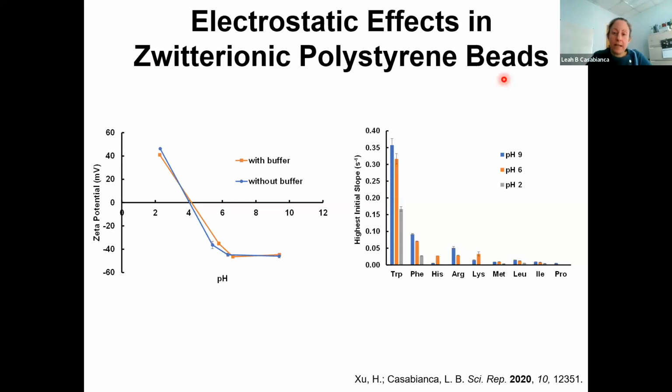Aside from aromatic interactions, we also saw that electrostatic effects were important in this binding. So to explore this in more detail, we looked at zwitterionic polystyrene beads that, again, we could purchase commercially. These have a mixture of carboxylate and amine groups on the surface, so that at low pH, they're positively charged, and at neutral and high pH, they are negatively charged.